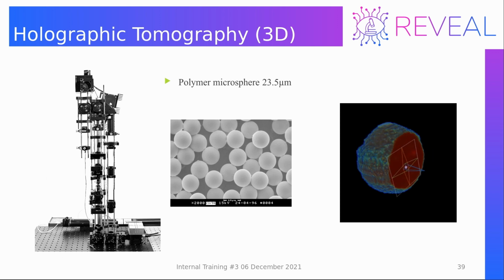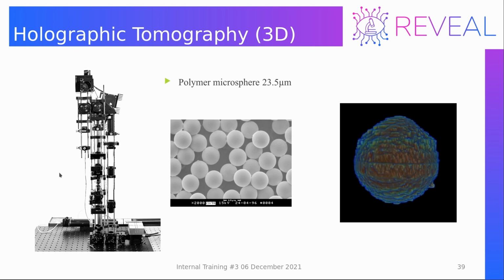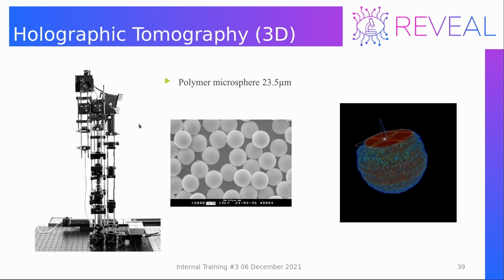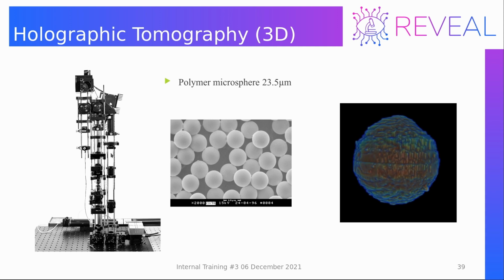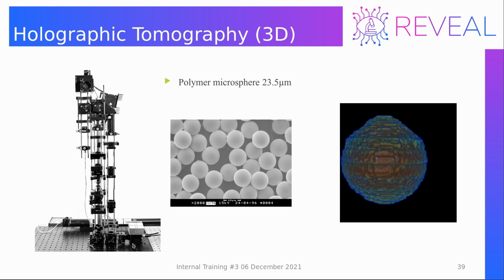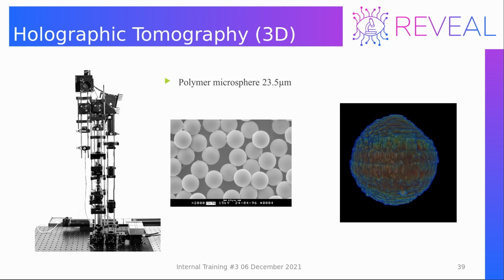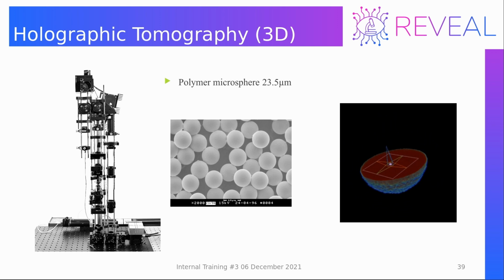So this is our laboratory setup that we use to make measurements. This is one of our setups, and I show it not to scare you, but to show you that holographic tomography is in principle a more complicated technique than a holographic microscopy system.